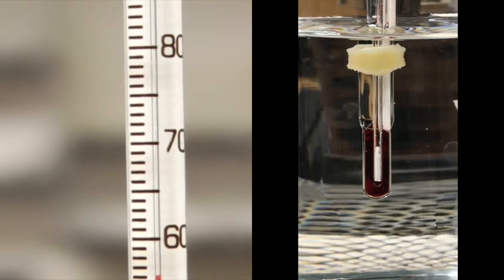Alright, so you can just see it inching under the camera there. And everything's still solid in the tube.